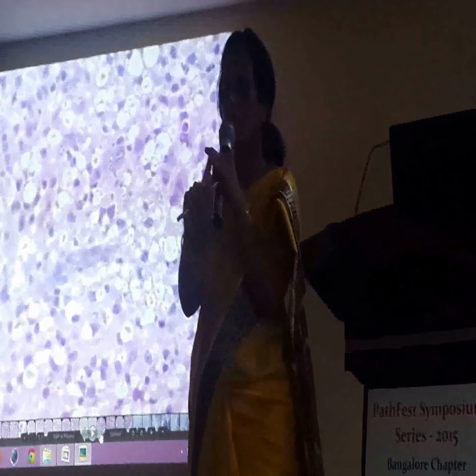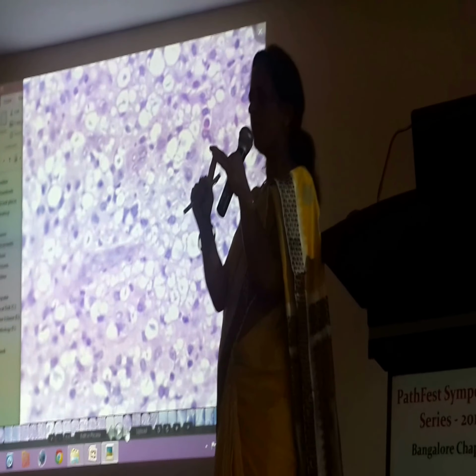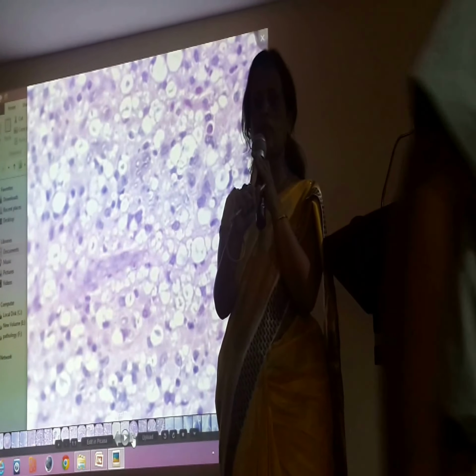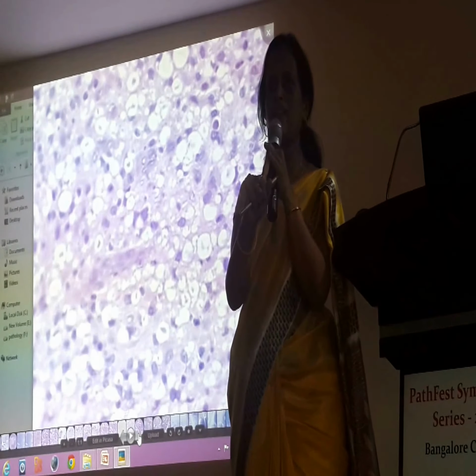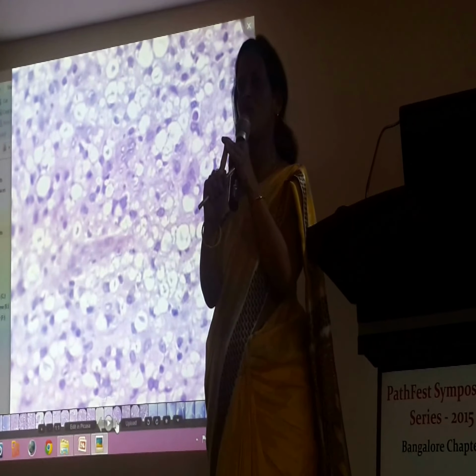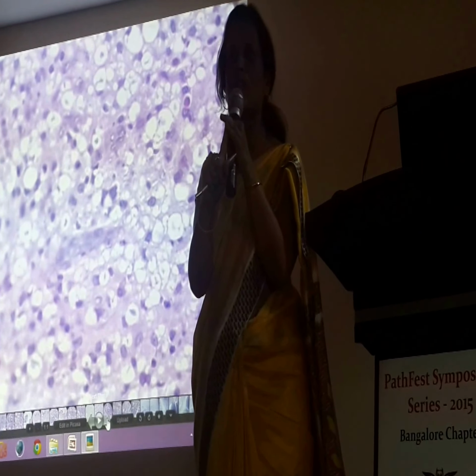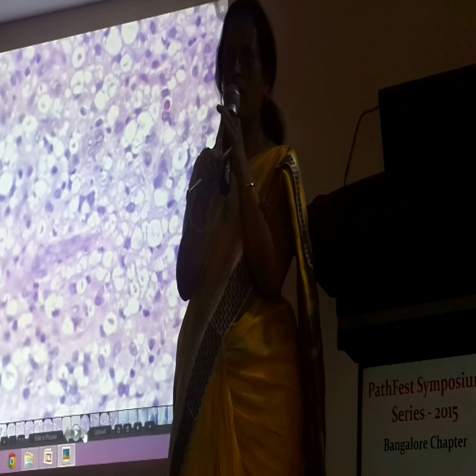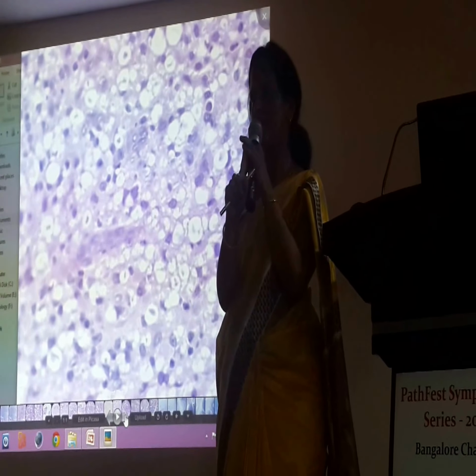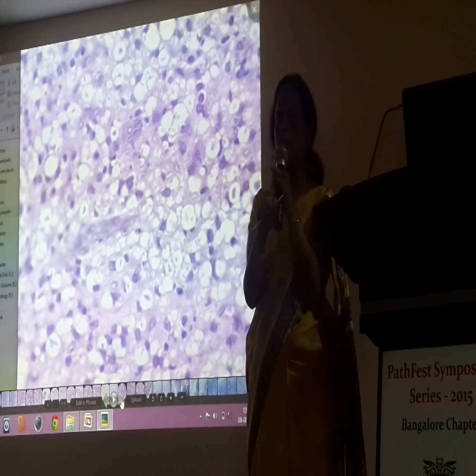Okay, first step is you have to bring the sections to water. What do you do after you take the section? To deparaffinize. So what is the first step for Wade Fite-Faraco modified? Very good. You have to use peanut oil mixed with xylene for deparaffinization. Why? Because that is supposed to restore the acid fastness of the bacilli. Then use a lesser concentration. You may just go with 2% sulfuric acid for this.